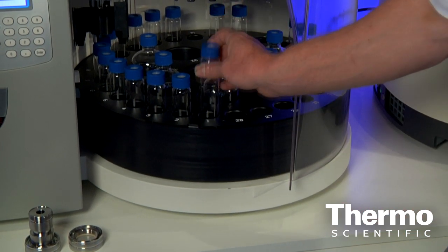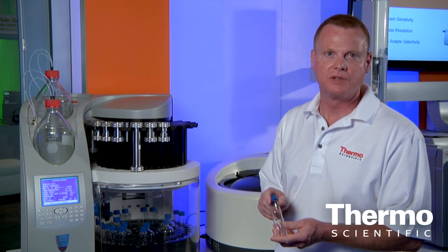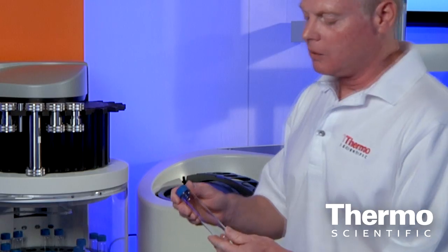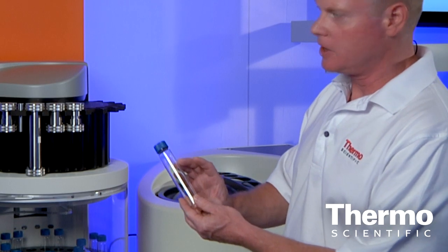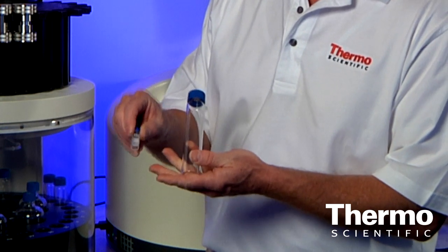Once we have the extract created, the next stage in our analysis is concentration. We are often looking at very trace levels of analytes — a part per million or a part per billion — and we have to reduce the volume that's generated to something on this magnitude in order to do the analyses.